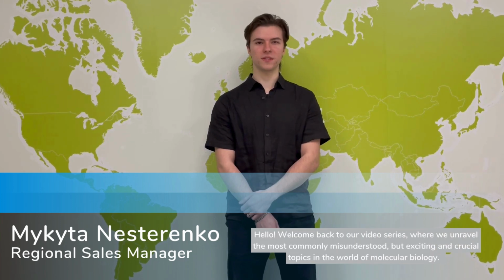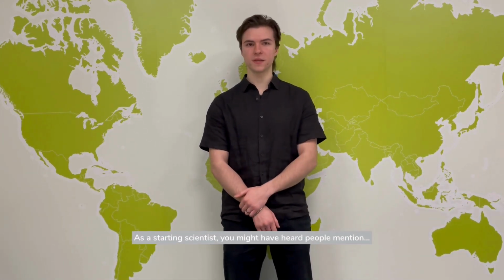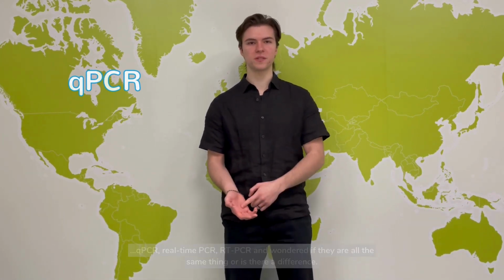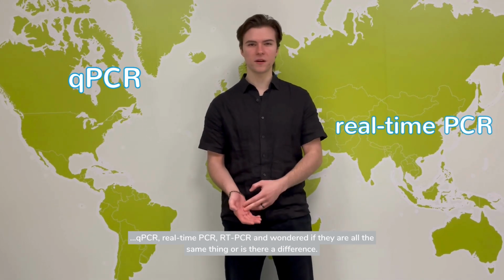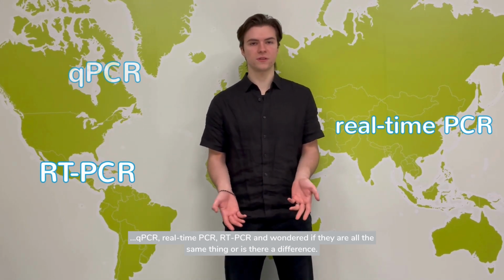Welcome back to our video series, where we unravel the most commonly misunderstood but exciting and crucial topics in the world of molecular biology. As a starting scientist, you might have heard people mention qPCR, real-time PCR, RT-PCR, and wondered if they're all the same thing, or is there a difference?